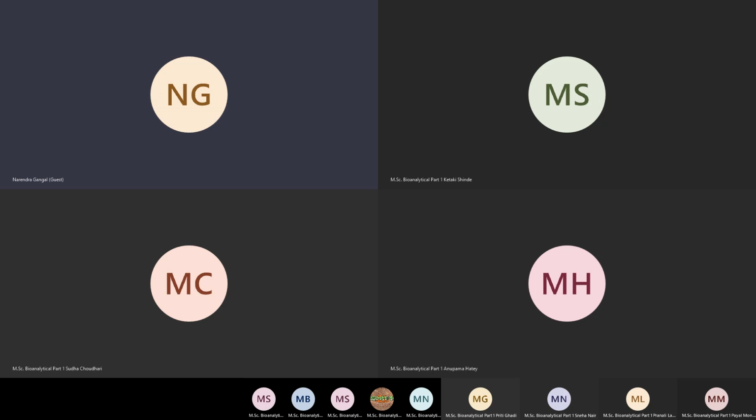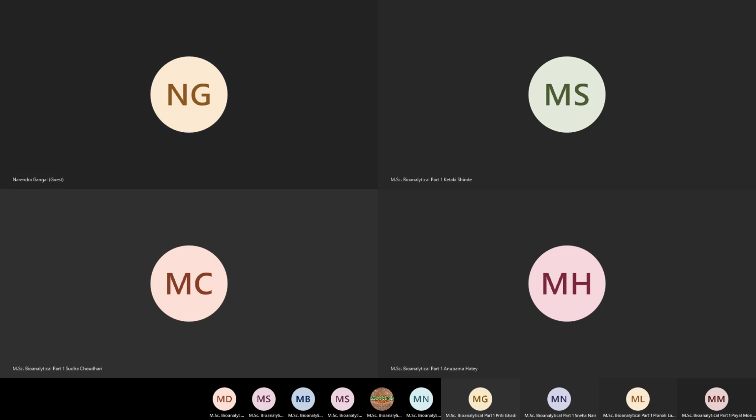We saw three reagent gases: methane, isobutane and ammonia. Ammonia is a very good gas, but because of corrosion and other properties it is less preferred in industry, whereas methane is available in a very pure form and is the most preferred reagent gas in chemical ionization.